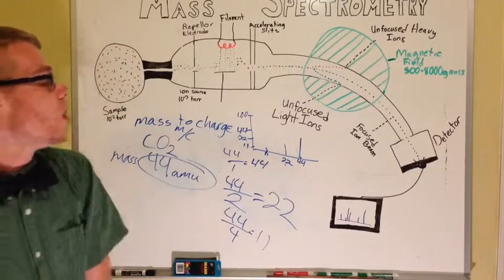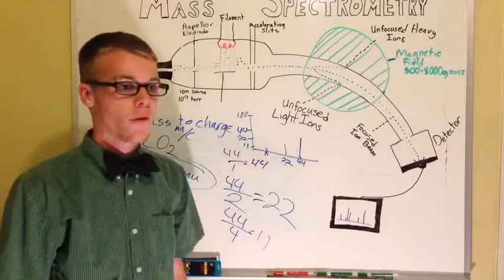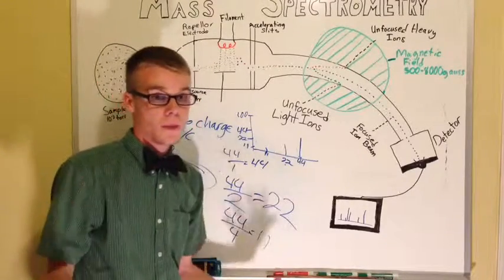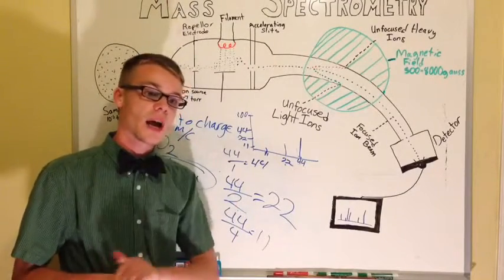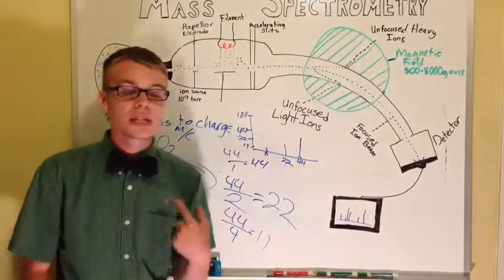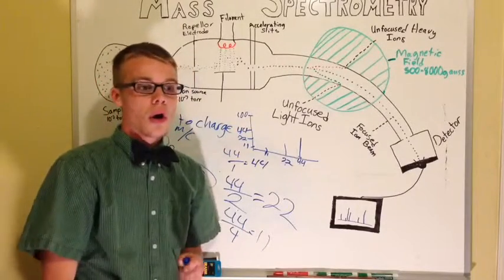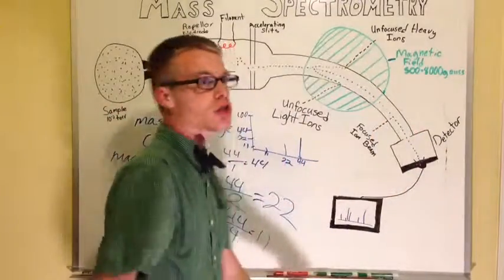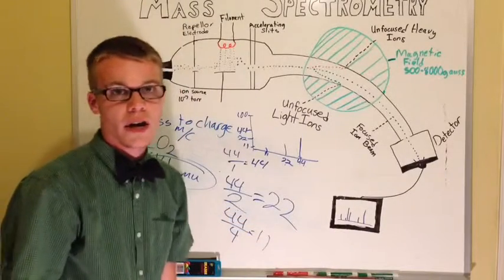And lastly, I want to talk about where we can see this in real life. This is used in crime shows all the time. If they show the forensic science side or any of the science side of a crime, they normally use this machine, such as on NCIS. NCIS uses this machine a lot. When Abby says, let's put this through the mass spec, she means this machine. Let's put this through this machine to find what ions are in the body or something.